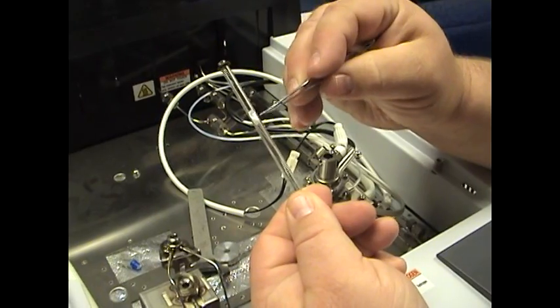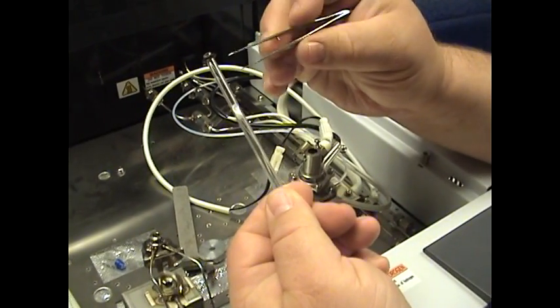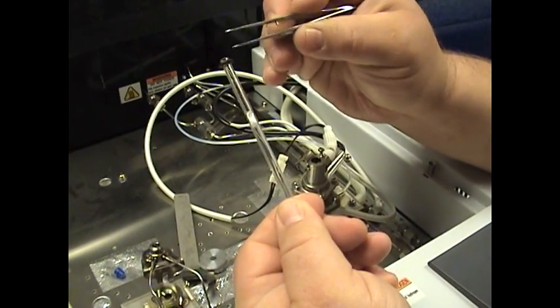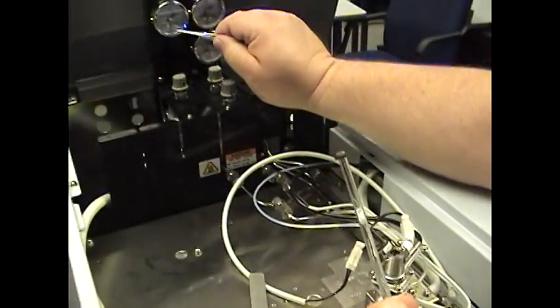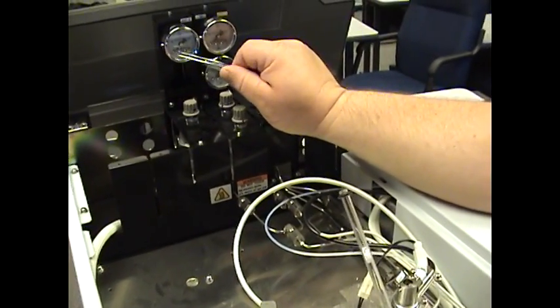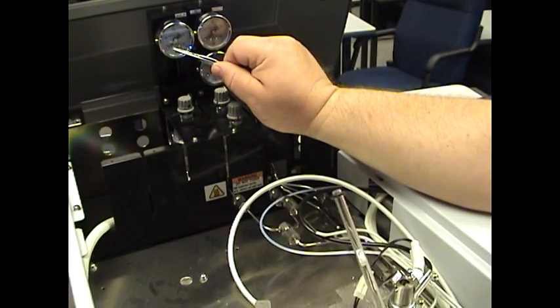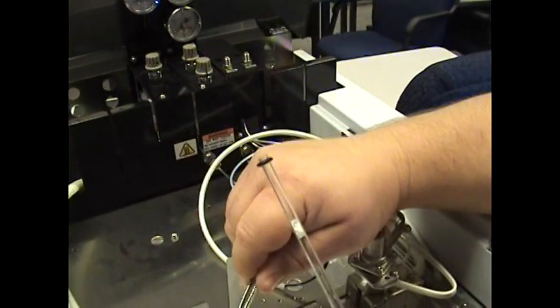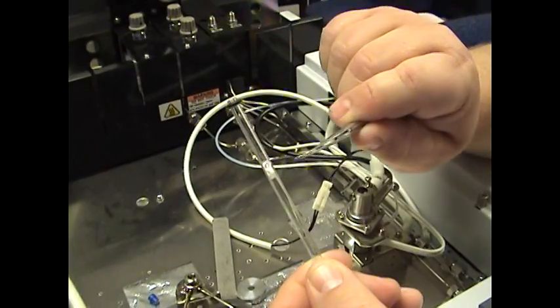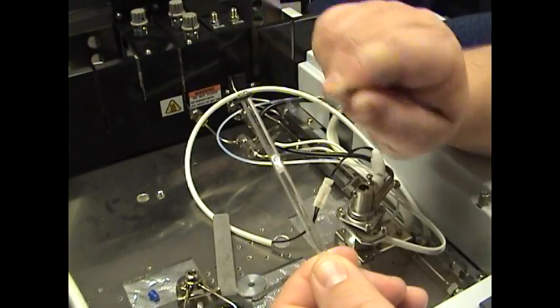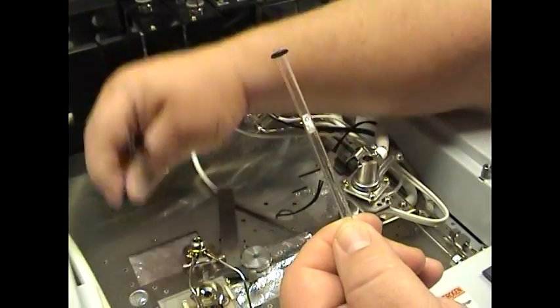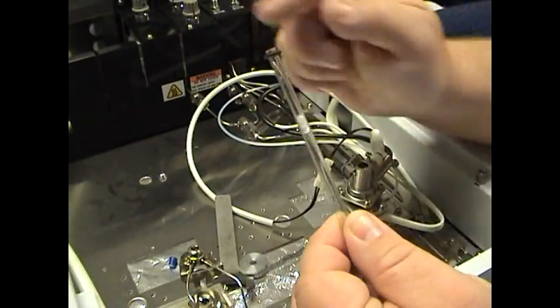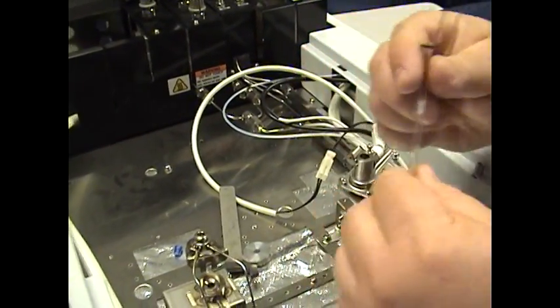You'll notice the quartz wool is in there. If you see the quartz wool up here or completely missing, that means that when we talked about having your makeup gas to zero, you actually had a head pressure on here and that was not to zero and that blew out the quartz liner or quartz wool once you remove the septa. If you do that, just put a new liner in there.